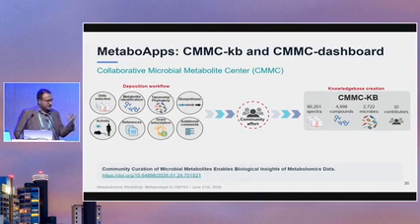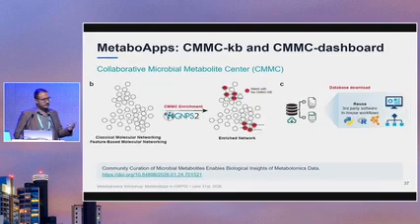So as I mentioned, it's a community effort. It's a collaborative work, as the name suggests. And the knowledge base creation was based on 80,000 spectra, almost 5,000 compounds, 2,000 microbes, with, as I said, over 30 contributors, basically 30 different researchers, 30 groups, of course, that are part of the CMMC.